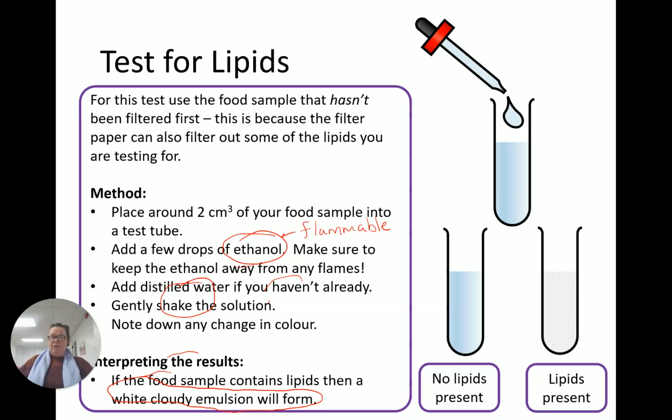So if you've got a revision card, this is a good one here. Chop it into 4. And then in each one, just put the food test, the reagent, so the chemical you need, and the colour it goes. And any other words like shake, something like that, or water bath, add those words too. You can get it on one revision card, what we've just done here. All right, so it shouldn't be too traumatic if it comes up.